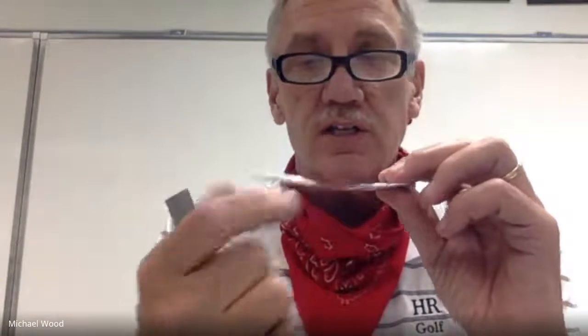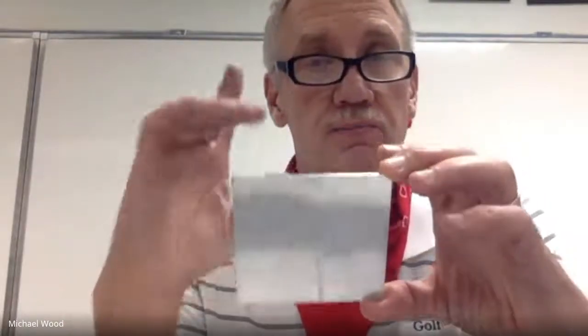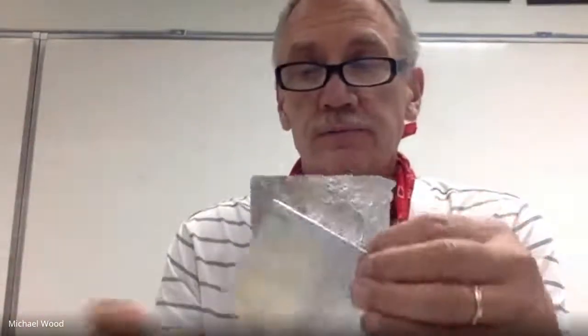One is going to be aluminum foil, and it's impossible to measure it directly, so we're going to go through a calculation on how to do that. We're going to find the thickness of this piece of aluminum, which we'll call the rectangle, and this piece of aluminum, which is called the square. So the first objective is to figure out the thickness of the foil, the rectangle, and the square.